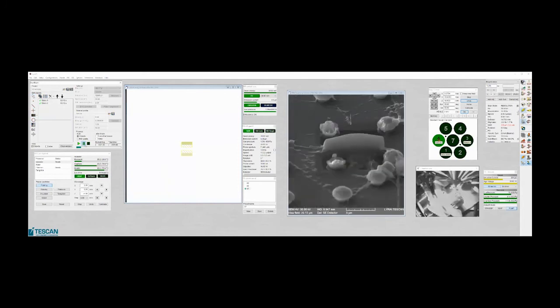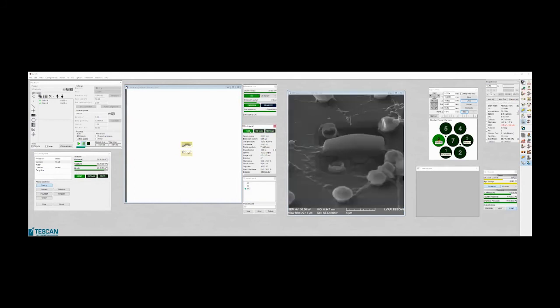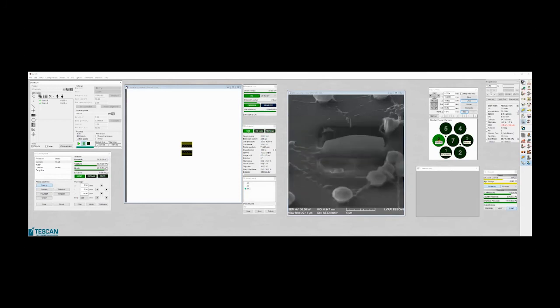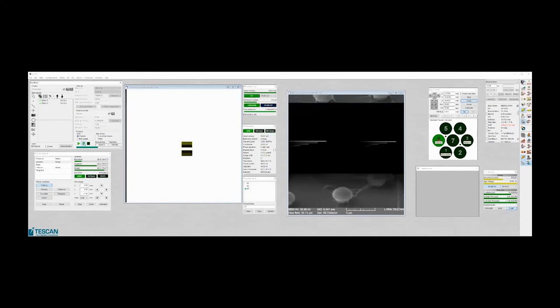Okay, it's running fine. Maybe one more.